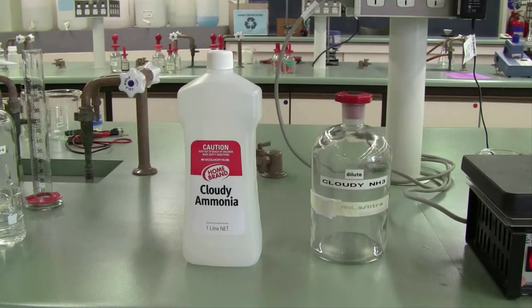When it comes to your write-up, there are a few simple facts for you to remember. First of all, you should think carefully about what a buffer solution is and what it's supposed to do, and then compare that with what you saw in the lab.